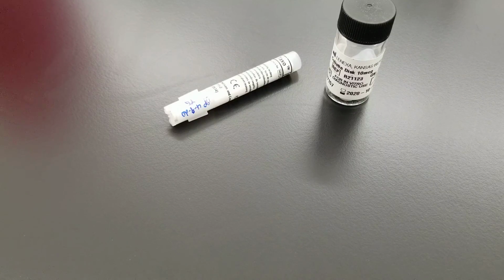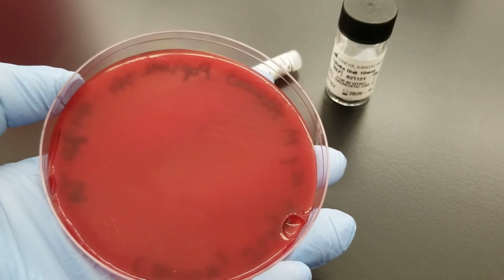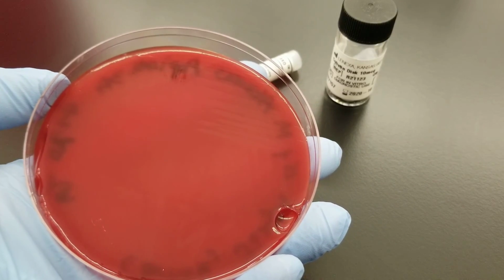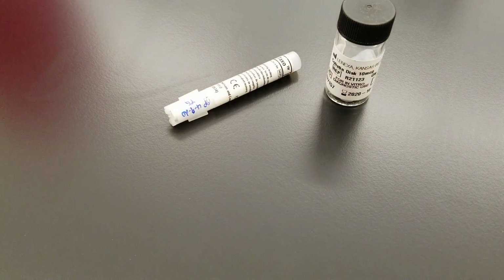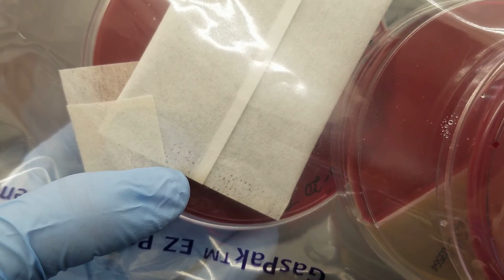Okay, so when you do pull out your primary setup and you're looking at the growth, and there is mixed growth all over the different plates, what you're going to do is for each different colony, you can subculture and gram stain it if it seems like that may be the pathogenic bacteria. You would be using the blood agar plate that was incubated in the CO2 incubator as part of the primary setup, and you would be using the Brucella blood agar plate from the anaerobic setup.